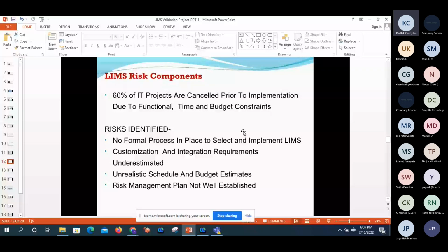For example, initially whatever is paper-based currently, they are going to implement electronic computer systems like LIMS. Let us say 100 materials are released from manufacturing to quality control every month. After implementation of LIMS, this will decrease to only 30-40. Why? Because it will take time for the end user to understand the system, so the batches are not released properly as per the management expectation.